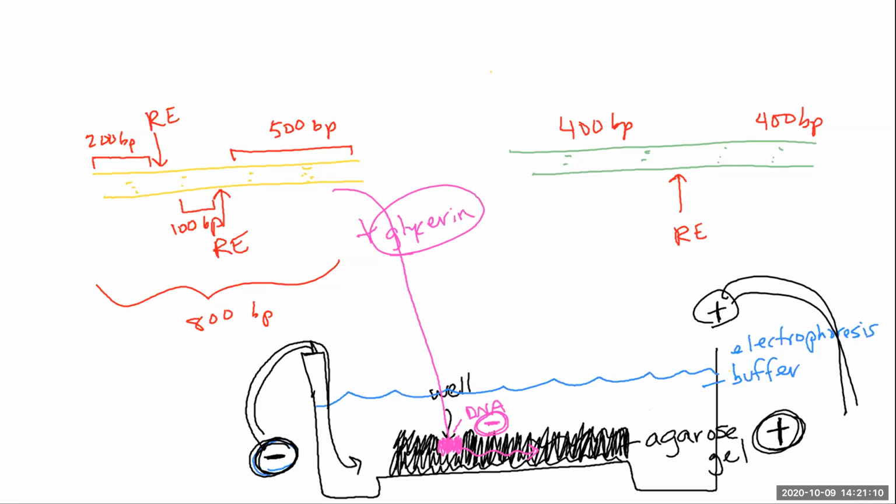So what's going to happen in gel electrophoresis is that we're going to start to see these bands. The DNA is going to start migrating through the agarose in a very specific way. These little bands are going to migrate, so hopefully that's making sense. If I could look at my gel from the other direction, from the top, let's imagine I'm looking at those wells, this hole from here.